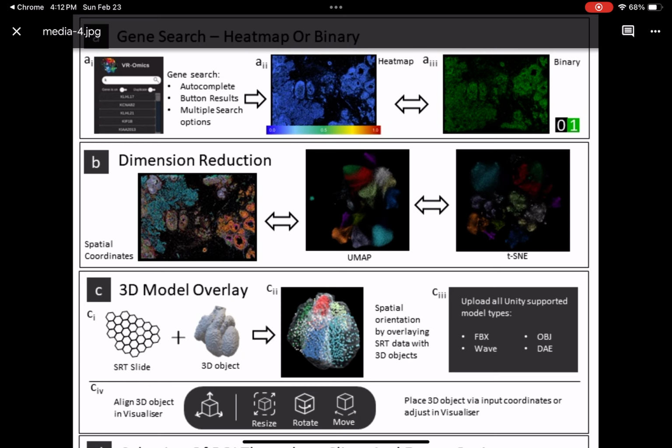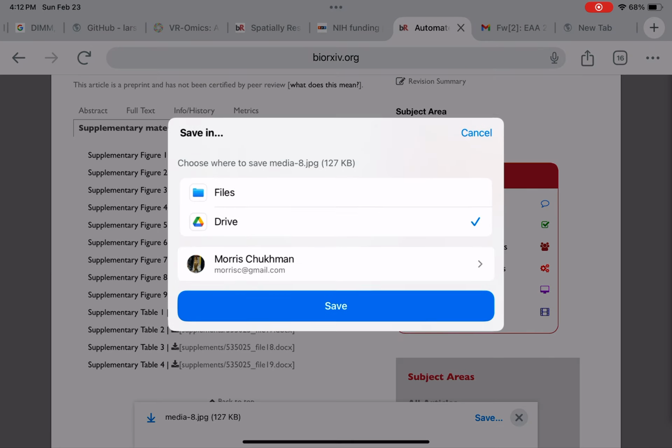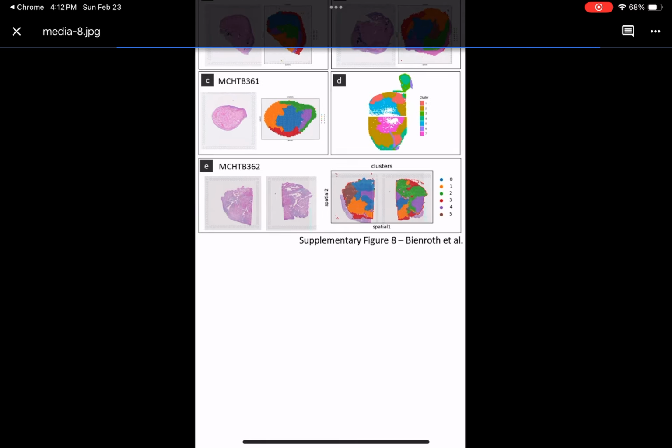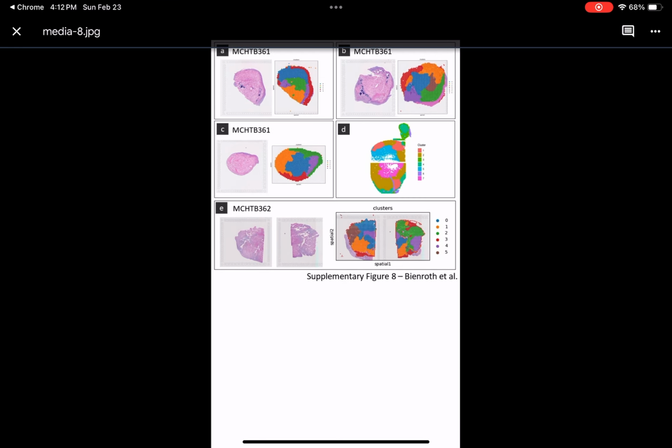Outputs from both batches of Visium experiments were reanalyzed through the Space Ranger pipeline V2.0.1.37 by the WEHI team. The outputs of the Space Ranger pipeline for all samples were used as the inputs to VR-Omics. This included using the visualizer to align multiple 2D slices and generate a joint, co-planar data object, supplementary video 1, and ScanPy pre-processing including clustering using STAGATE.